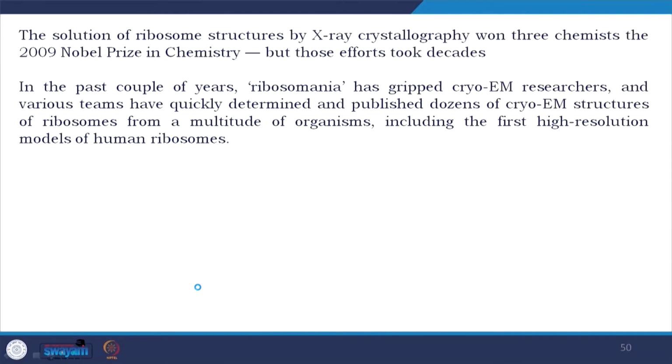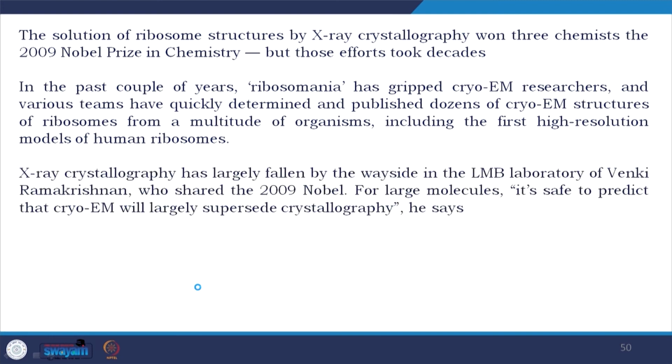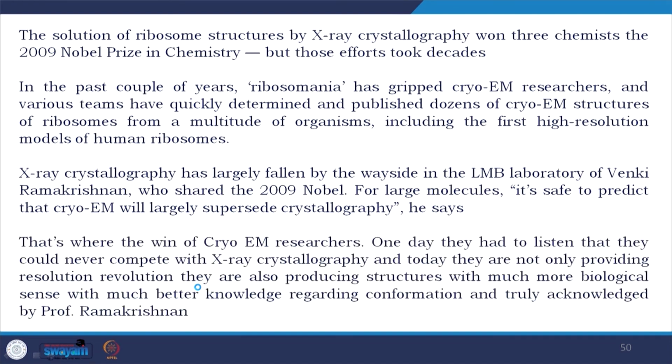So, various teams have quickly determined and published dozens of cryo-electron microscopy structures of the ribosome from a multitude of organisms, including the first high resolution model of the human ribosome. As I told you, X-ray crystallography has largely fallen by the wayside in the LMB laboratory of Venki Ramakrishnan, who shared the 2009 Nobel. For large molecules, it is safe to predict that cryo-EM will largely supersede crystallography, he says. So, that is where cryo-electron microscopy researchers have won.